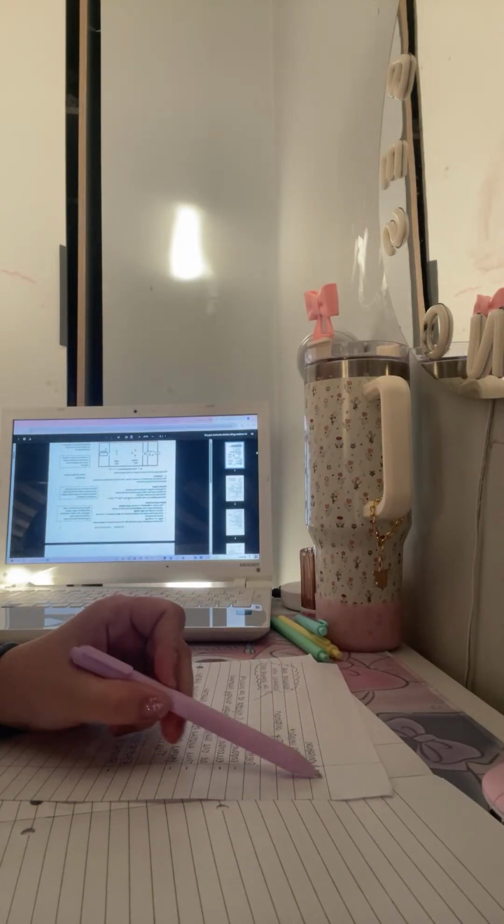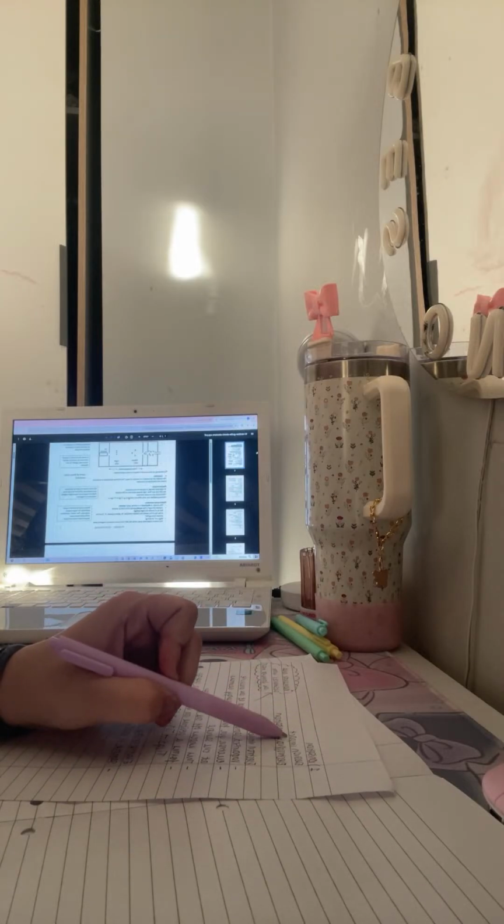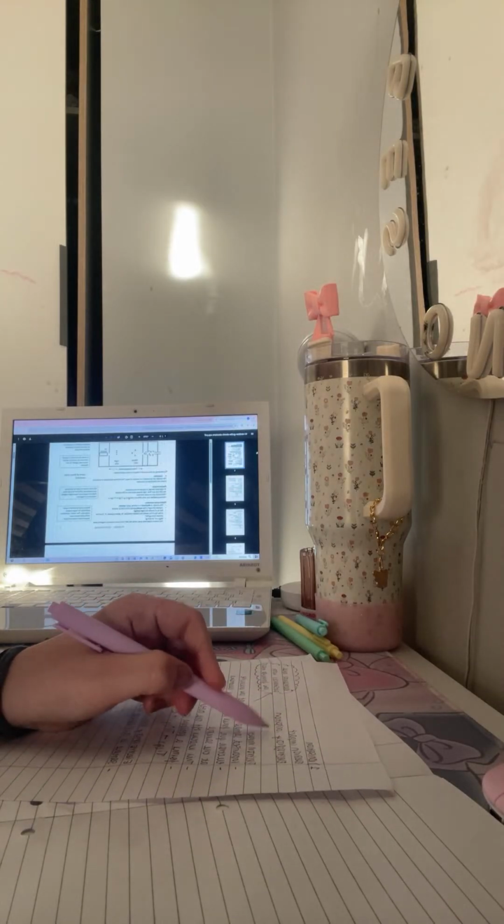We have a time of flight mass spectrometer, which determines the isotopes that are present, and that helps us identify the element. We have to make sure that it's in a vacuum so that air particles don't get ionized and registered, because we just want to know what the element is. The first step in the mass spectrometer is ionization, and this can be done in two ways: electron impact and electrospray ionization.